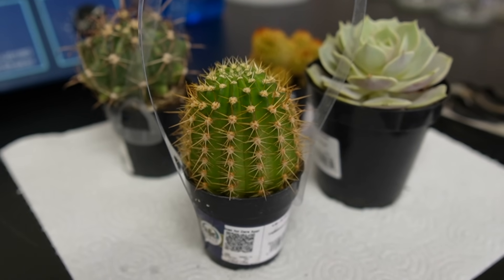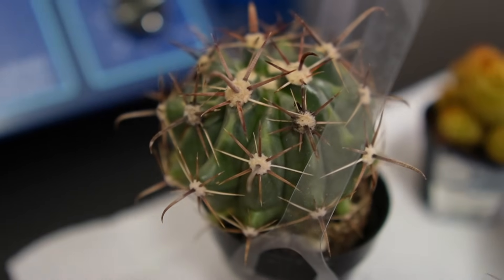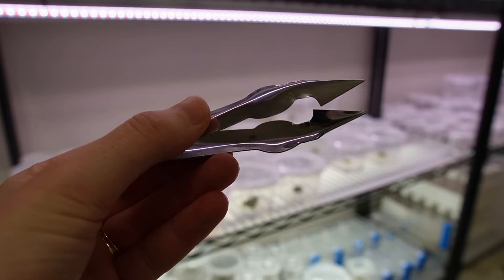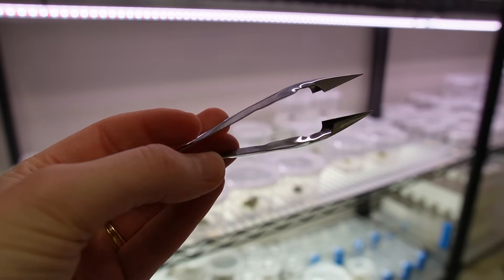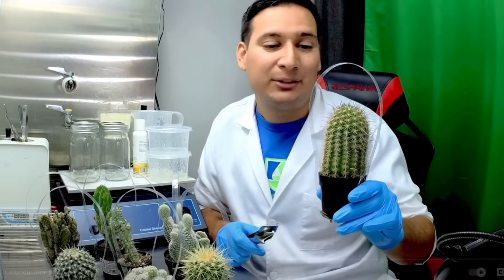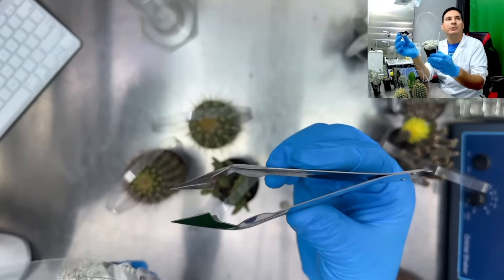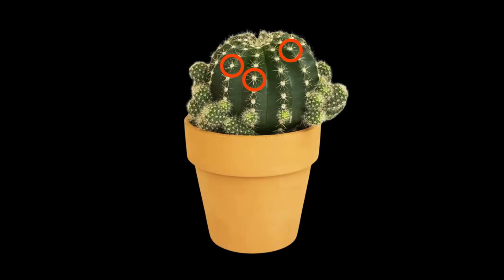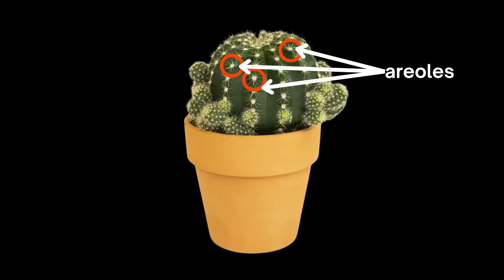I did manage to procure some plants, and we are going to use them to gather explants, which is a fancy word for tissue samples. The tool I'm using to take my explants is a pineapple cutter — I saw Francisco from Plant Cell Technology use one, so I bought one. Before we start, a quick anatomy lesson: these spots on a cactus are called areoles.